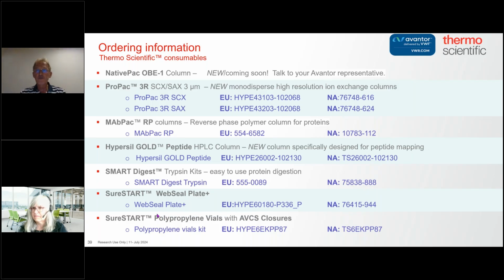But there will always be some deamidated peptides you can't separate at all. And in that case, you've got to go up to around 120,000 resolution, and you will see the difference. But if you're down at 15,000 or 30,000, you won't be able to pick out the deamidated peptide from the non-deamidated peptide unless you've got a separation. Certainly resolution will do it, but you have got to be up near 120,000 to pull that off, and then you're looking at a good Orbitrap for that.